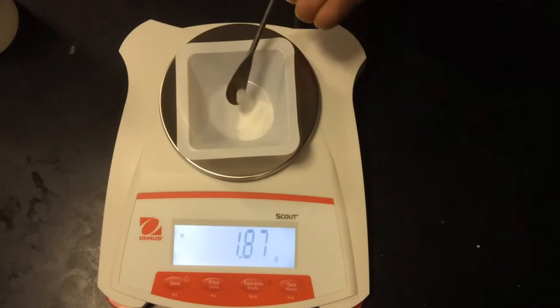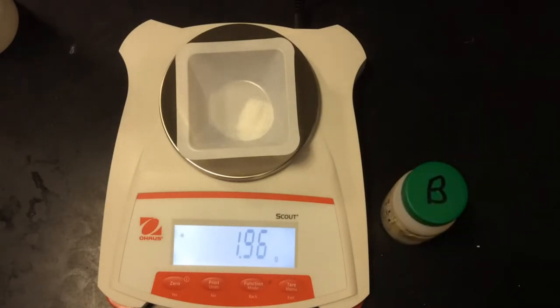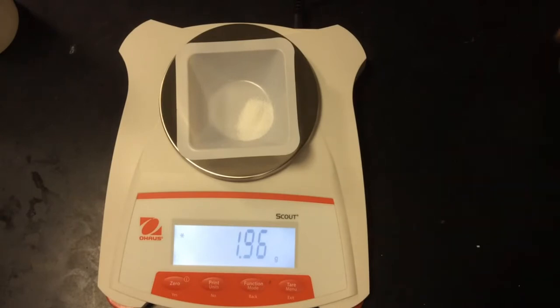So 1.96 is going to be the grams of the salt, and I'm writing down salt B in my lab book or my write-up so that I know that I'm dealing with B, and we can check at the end, or the teacher can check at the end, the accuracy of results.